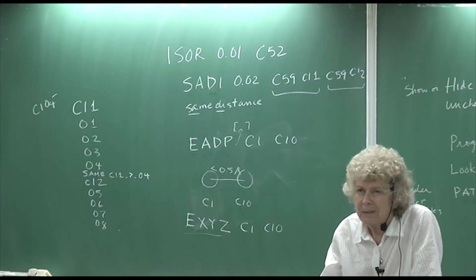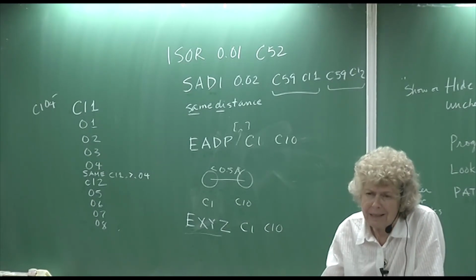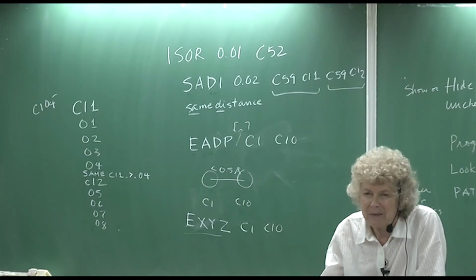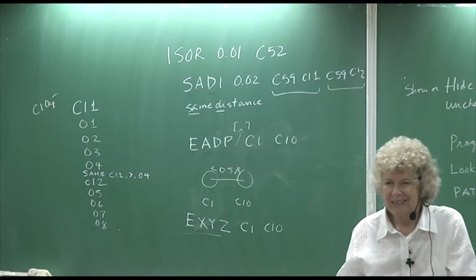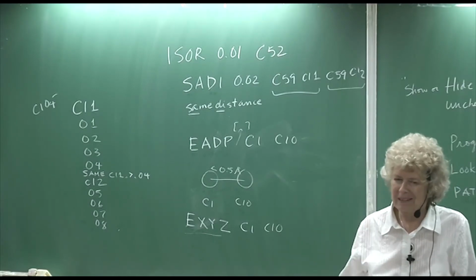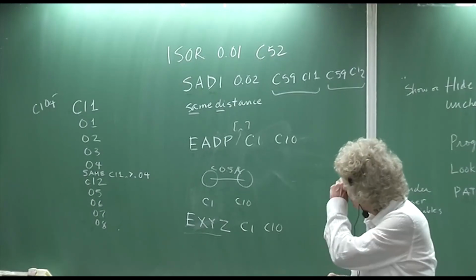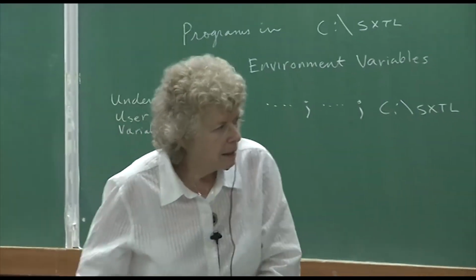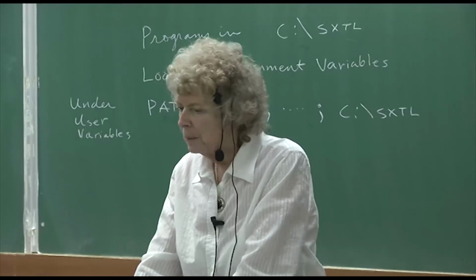So SHELX was really written about 1976, and there have been many, many versions since then. With each version, there are new features, and so I have the advantage of having used it from day one, and I only had to know a limited number of commands, and now there are more and more and more. It always makes it more difficult. So there are a lot of tricks, and fortunately, some of the software will help you out with that.